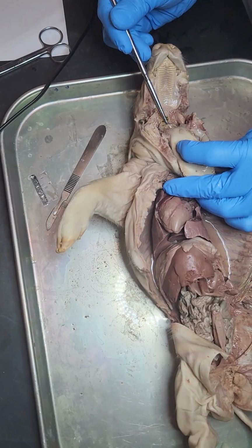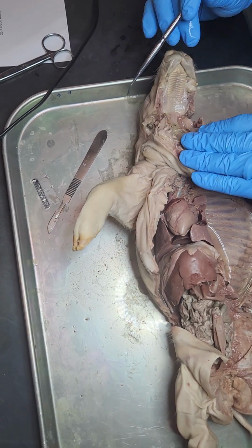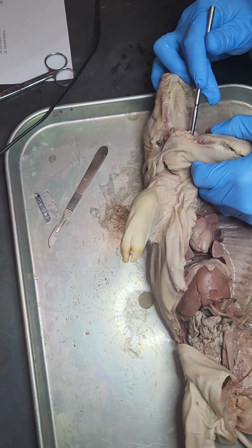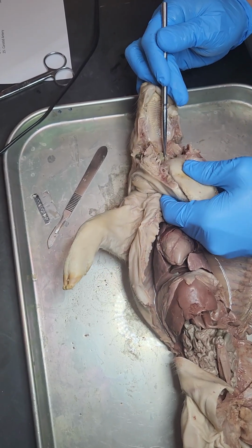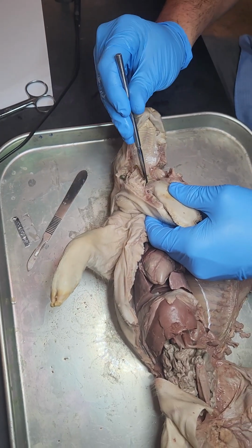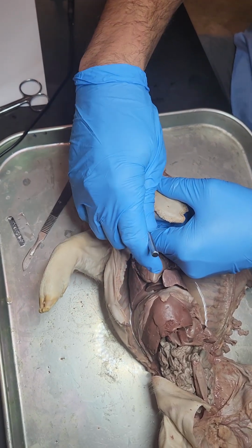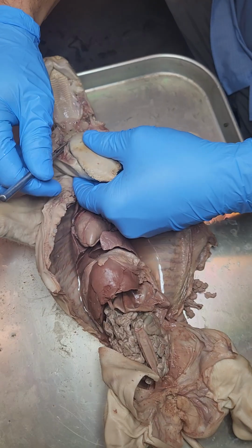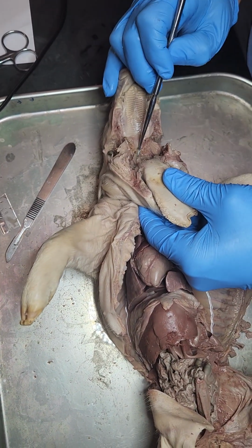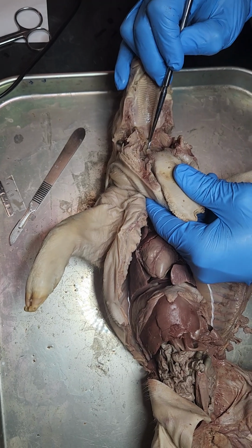How we get into that is we go down the glottis here, which is kind of disappeared on us a little bit here. I'll have to pop it back out. There it is. Okay, so we go into the glottis. We take the probe and we'll spin it around and then come back up inside that. Now I'm in the nasopharynx. Okay, so the glottis oftentimes will tuck into the nasopharynx. So if you push down, you can find it.